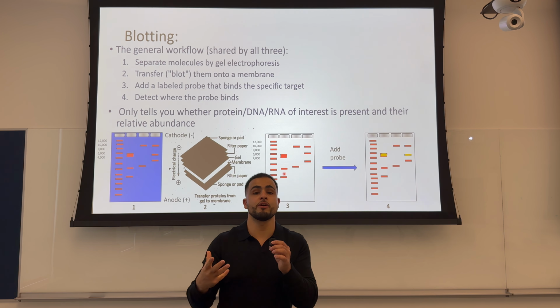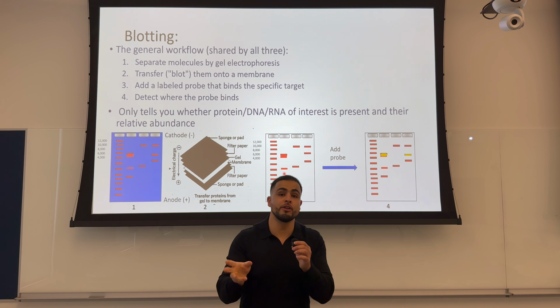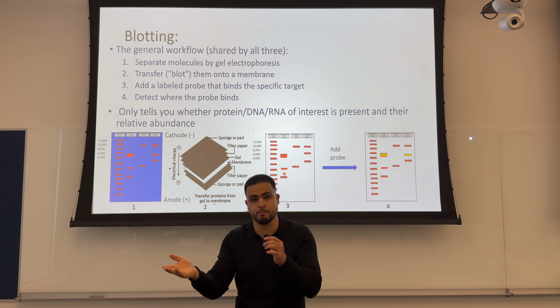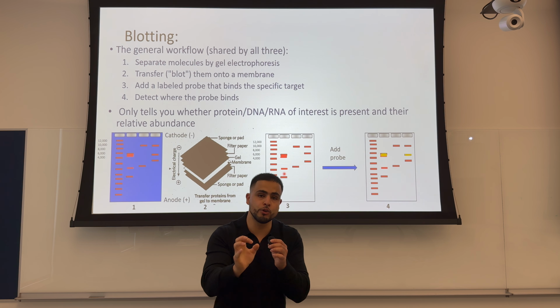So it'll tell you whether that protein is present or not, and it'll tell you the relative abundance or the relative concentration compared to the other samples of how much is present in your sample of interest. But it's not going to tell you the exact concentration.